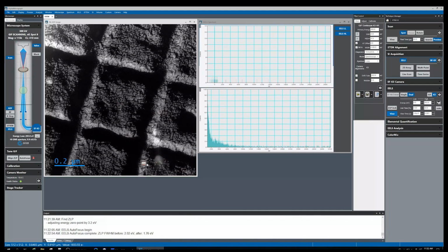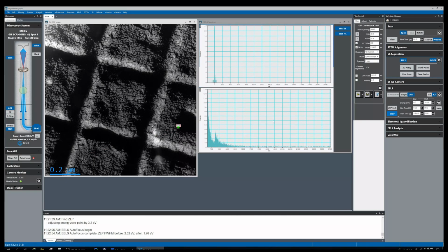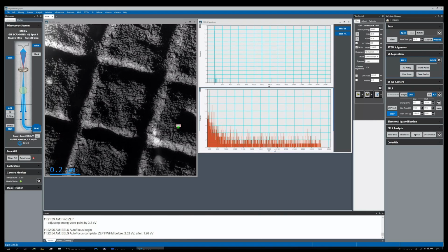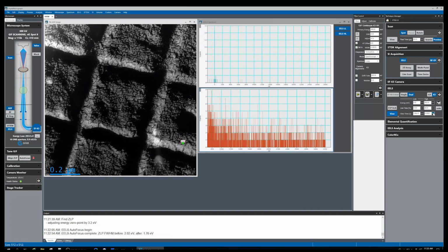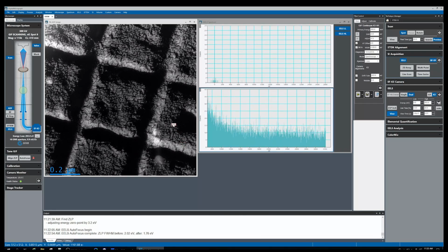So we can drag around the beam and see the spectrum, and we should confirm the edges of the elements we are going to map are showing in this live spectrum. And we already see the carbon. So next, let's check the gold, which is around 2200 eV. So looks like the spectrum is noisy. We can increase the exposure time a little bit.